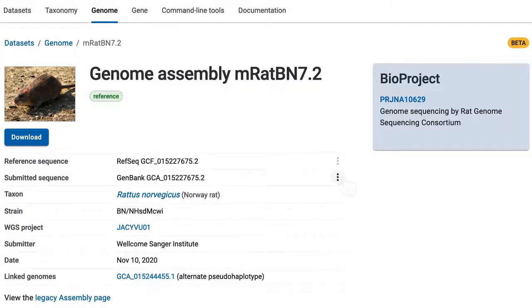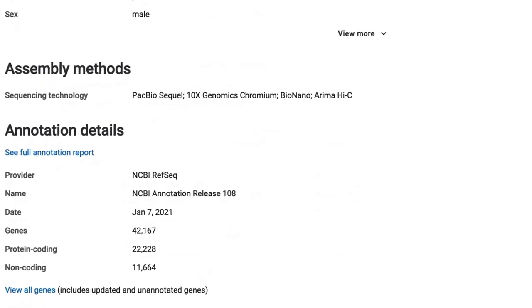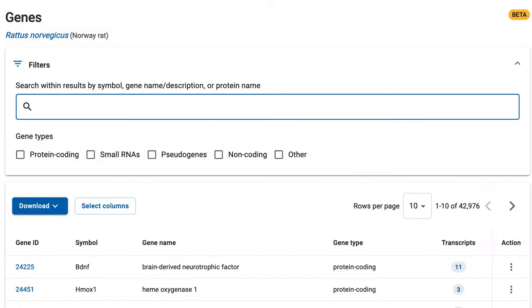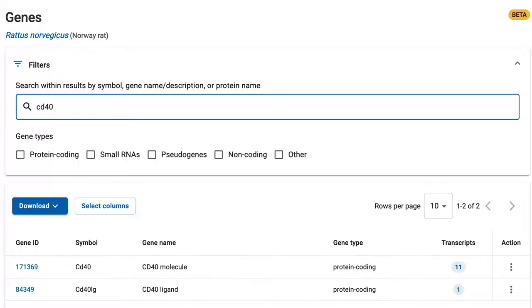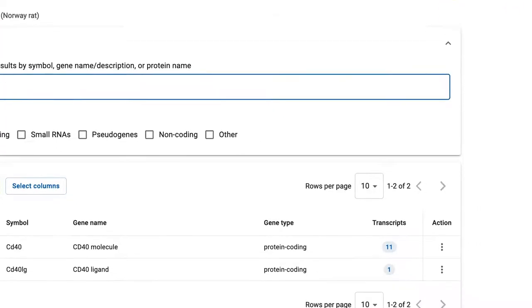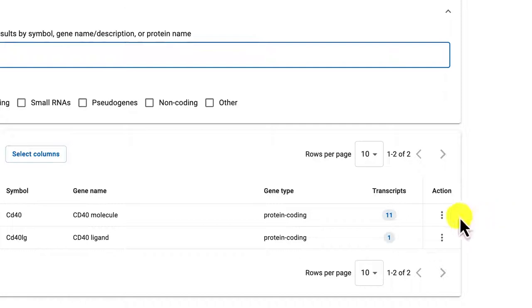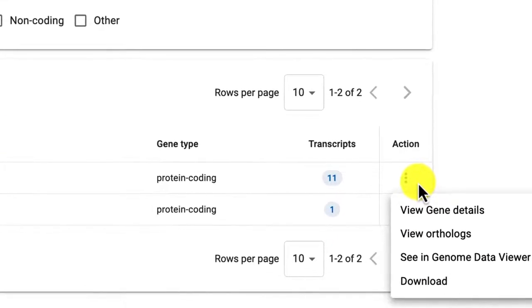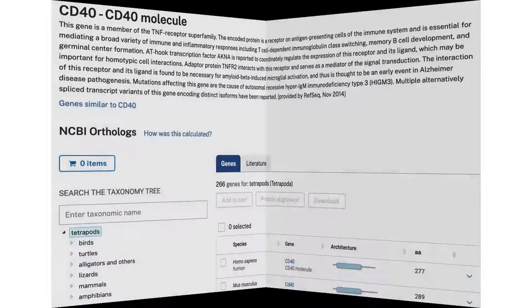Let's explore the gene data by following the link View All Genes in the Annotation Details section. I'll search for the gene CD40. Each gene has an Actions menu, where the View Gene Details link takes you to the gene record, and the View Orthologues link takes you to the same orthologues display that the gene record provides.